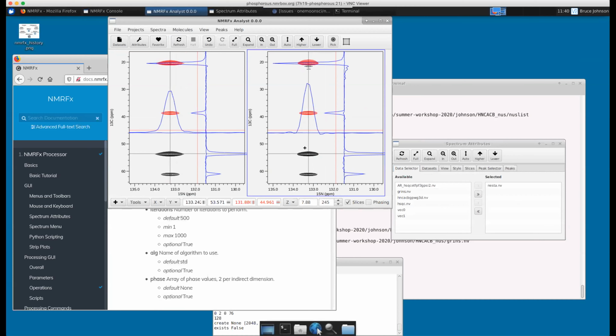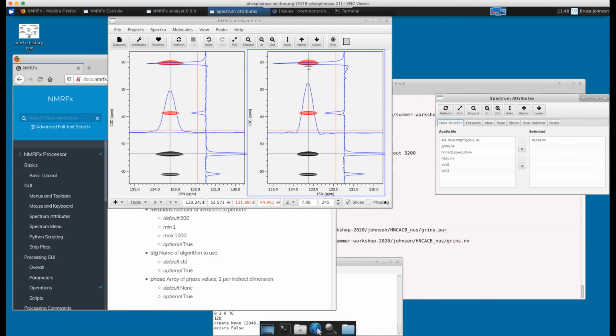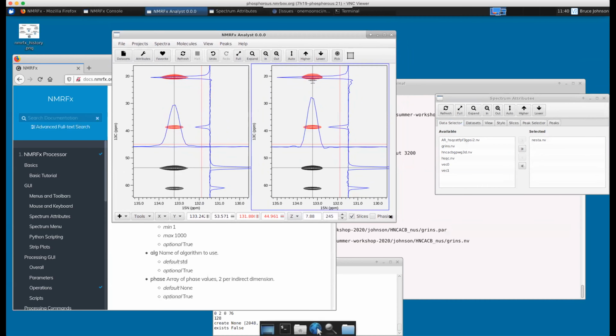And that comes back to a question I think you had asked, the whole question of doing apodization and how the apodization interacts, and whether you're doing apodization inside the NUS algorithm or outside. But the gist is we've got you a nice little interface here to compare, and it could be the same algorithm, different parameters. So that's pretty awesome. We're working on adding some scoring functions from the NUS competition, so you can actually go in and quantitatively compare. Yeah, that's pretty cool.